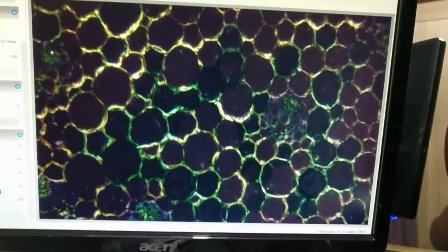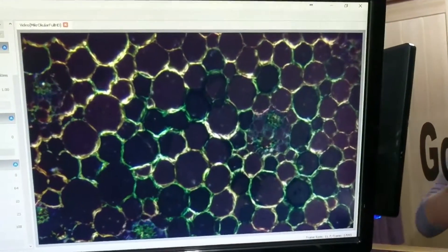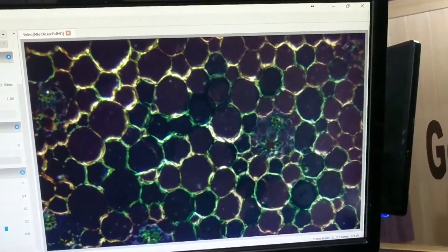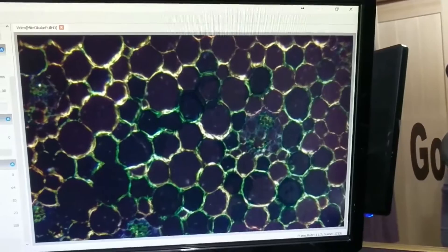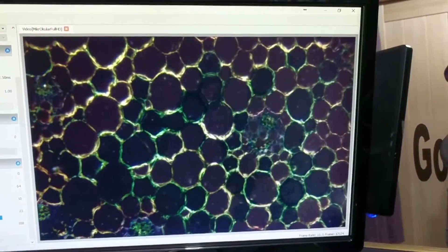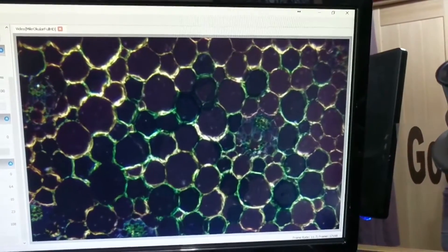But it still gives some fairly good results as you can hopefully see. It's not perfectly focused right now — I've just slapped the slide back on again. But I'm really hoping that this in conjunction with paramecium and other little microbiota is going to be quite a cool thing to see even with my little camera.